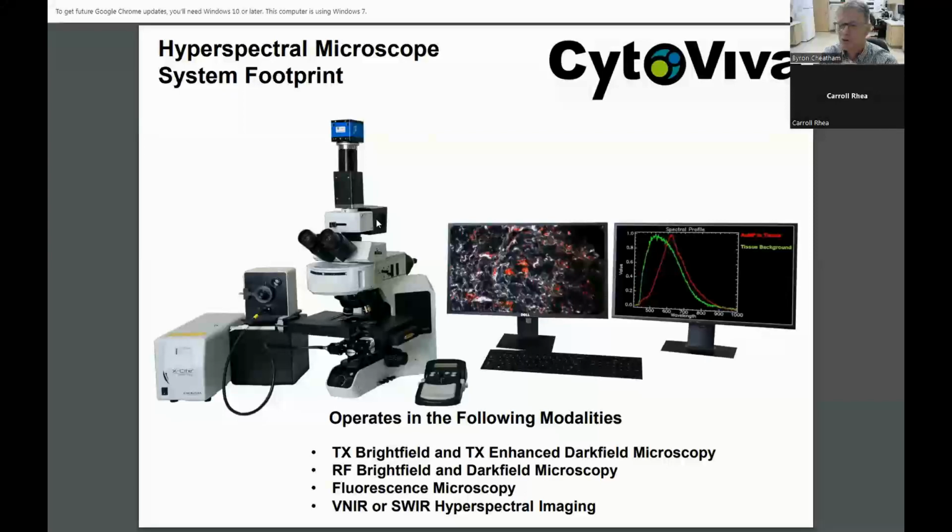That's what I used to show you the optical image that we first looked at of the cells and the nanoparticles. And you can simply switch back and forth between the two. Even if you have dynamic processes going on with your sample, with the optical camera, you have the ability to capture that as a video if you want, which can be very valuable.